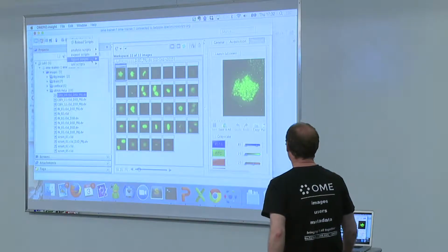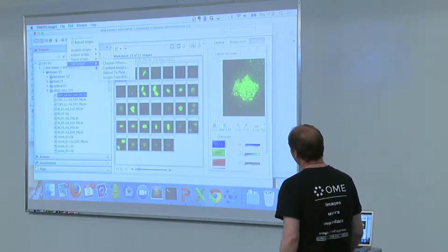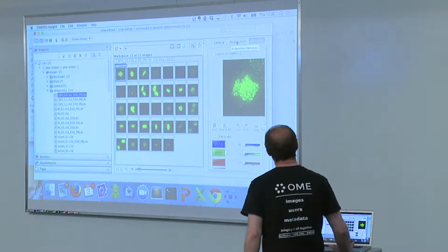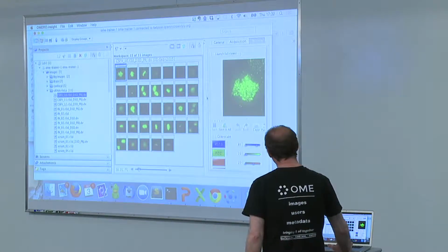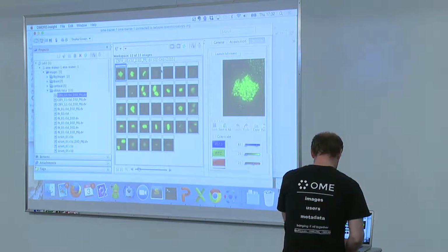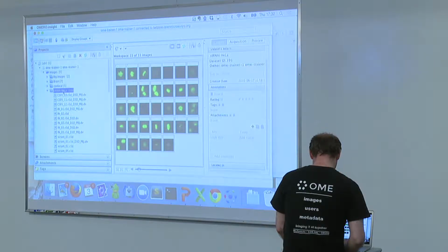How that will look is you have to imagine here an ImageJ menu item, and there will be all the scripts of ImageJ. This is still not ready to go, though. And you can run the scripts in the publishing scripts as well.